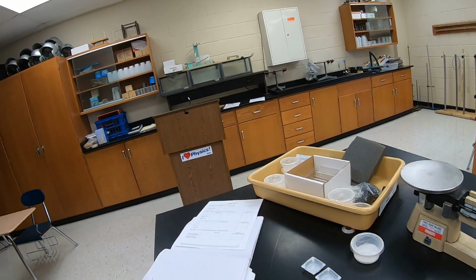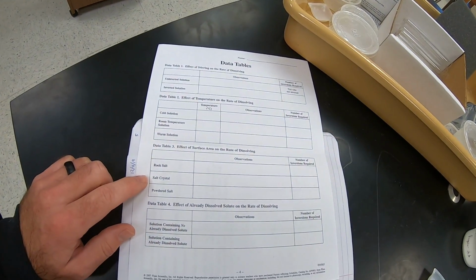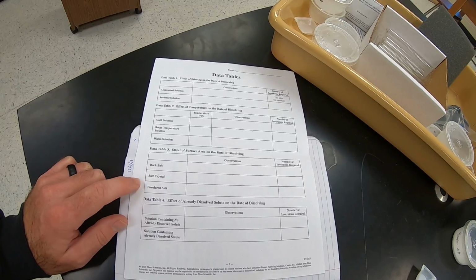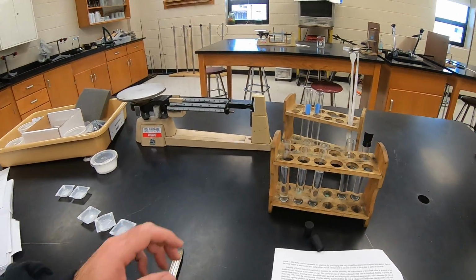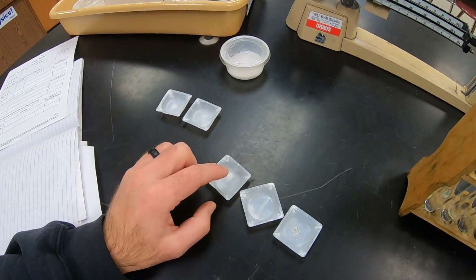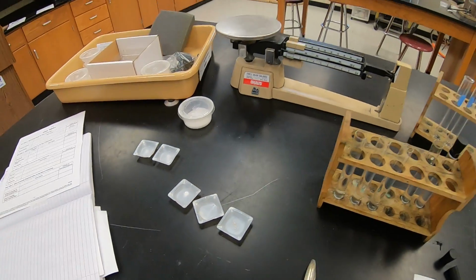Now we're going to do the factors affecting solubility part 3. This is where we're going to see how surface area affects solubility. I've got equal amounts of water in 3 different test tubes here, and I've got 0.2 grams of powdered salt, regular salt, and rock salt. So let's see what happens.